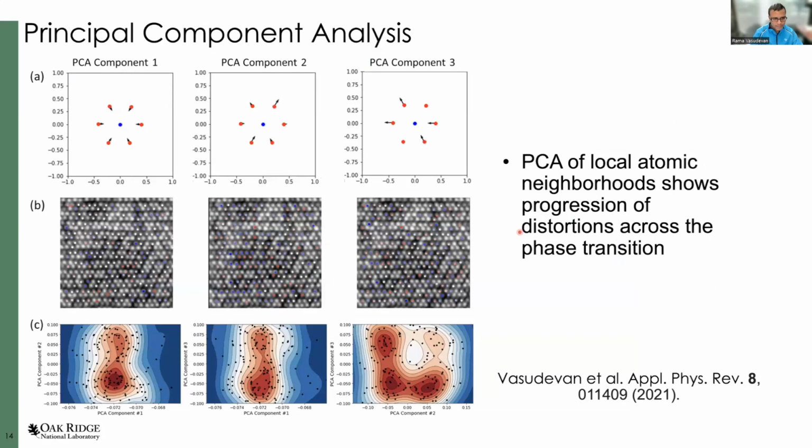And one way to do that is basically to identify every kind of atom in the system. We can very easily do this because these are nice STEM images. So we can use AtomAI, for example, and use deep convolutional neural nets to tell us where the atoms are and extract those atomic coordinates. But once you have those atomic coordinates, what we can do is compute principal component analysis of those neighborhoods. So let's say that I take each individual molybdenum atom and then look at its neighbors.